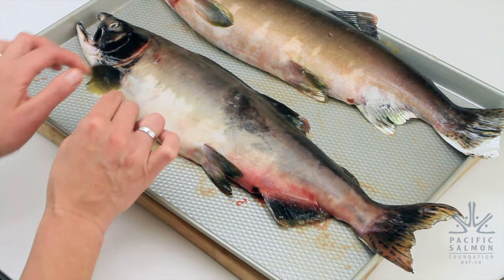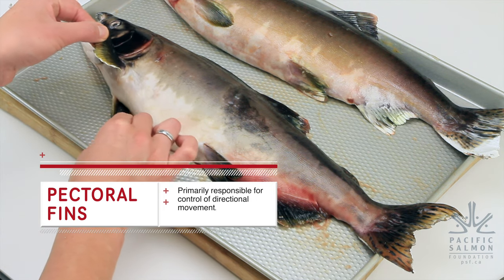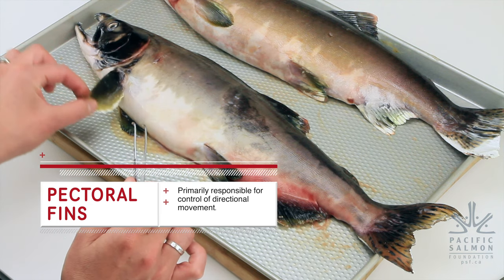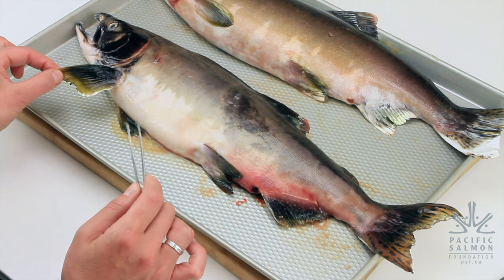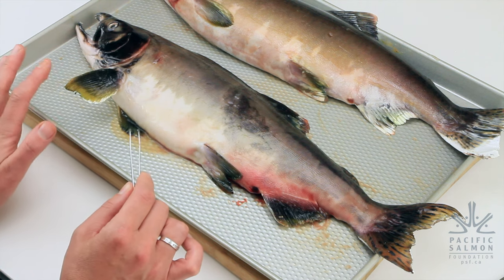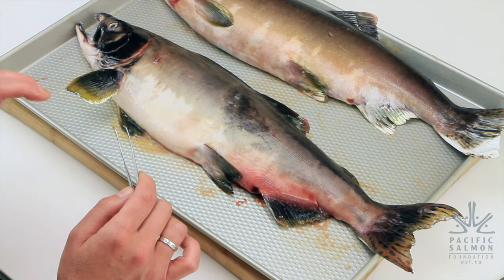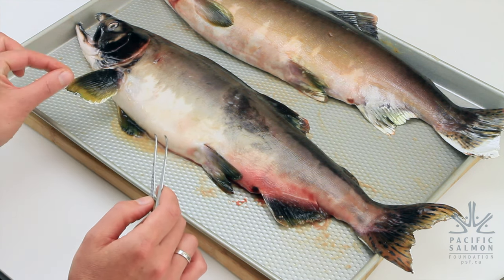Lastly, we've got the pectoral fins — again paired fins, so salmon have one on each side. They're also used for steering and balance, and these ones are particularly special because they help the fish move up and down in the water column. That covers the external anatomy of our salmon.